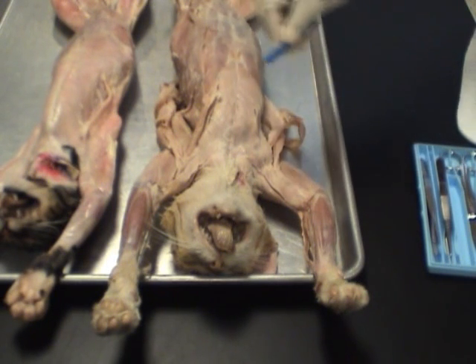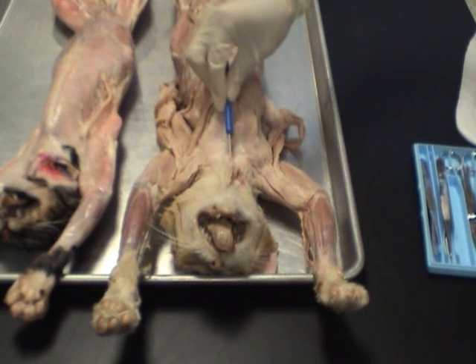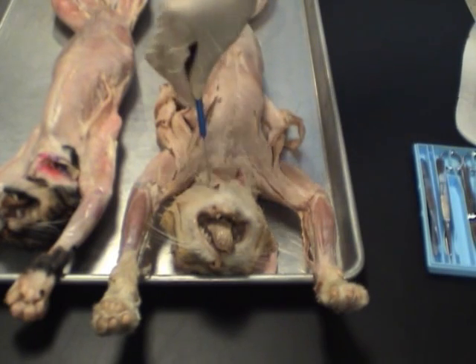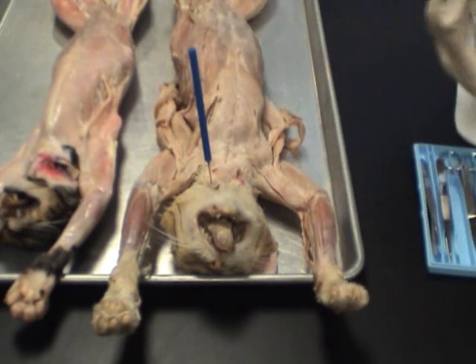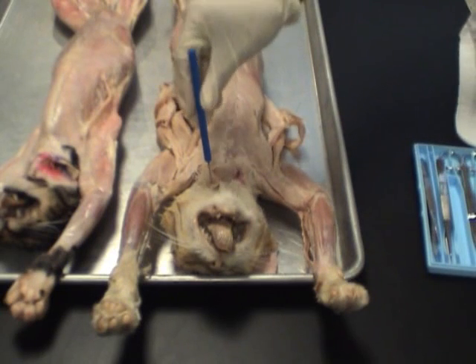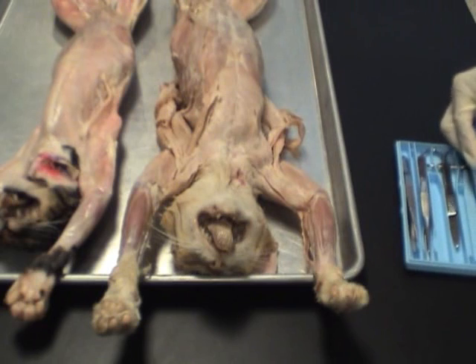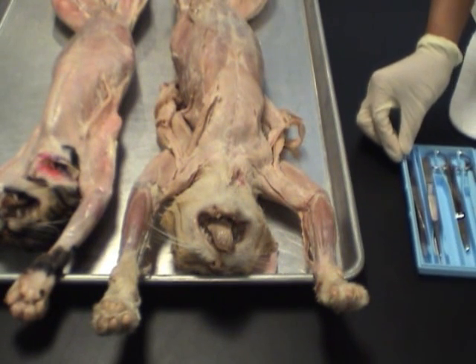For example, let's say I want to reflect this flap of skin right here, but I want to keep it in place. So I can use the sharp end and do that, and it will hold in place. We usually use this a lot when you take a test to show the muscle of interest. Okay, and then when you're done, you can move it out of the way, remove it, and put it back in. The next instrument let's talk about would be the tweezers.